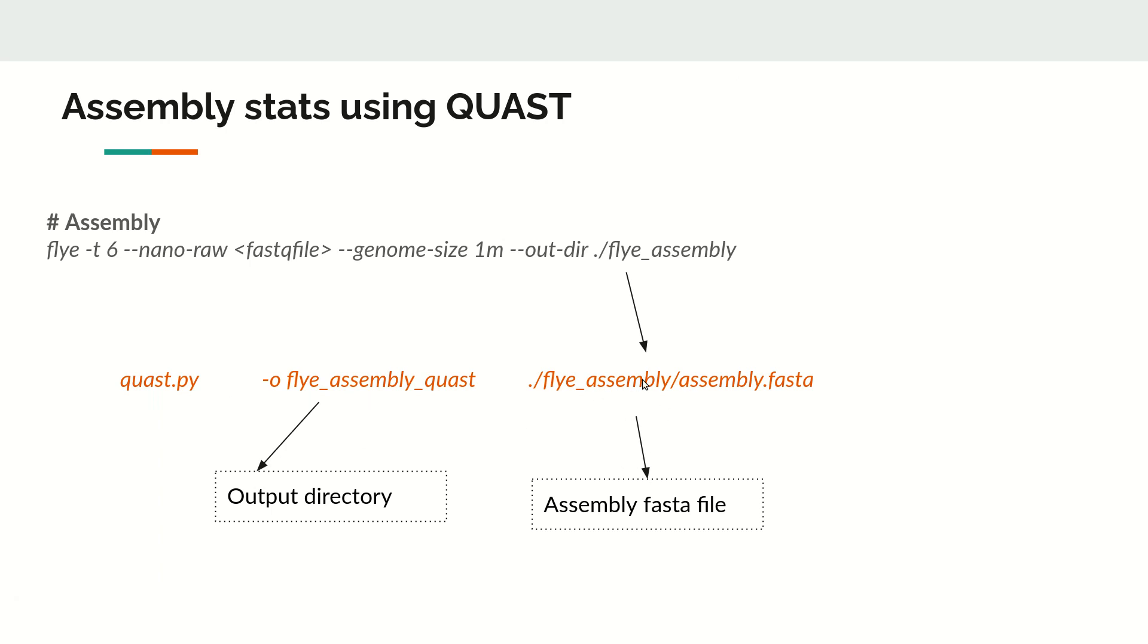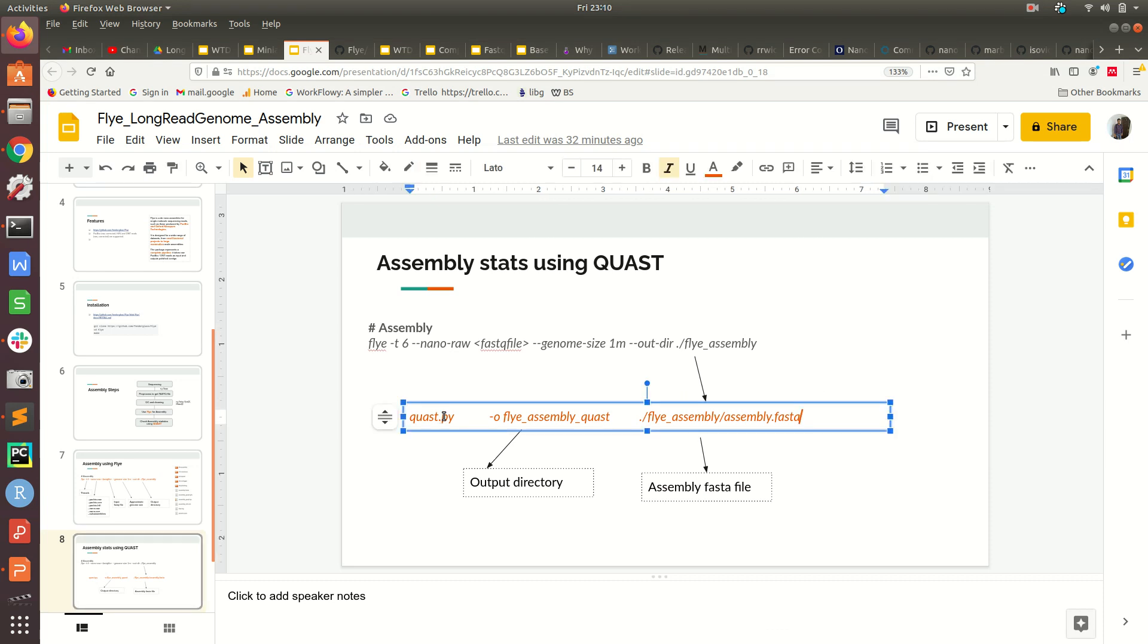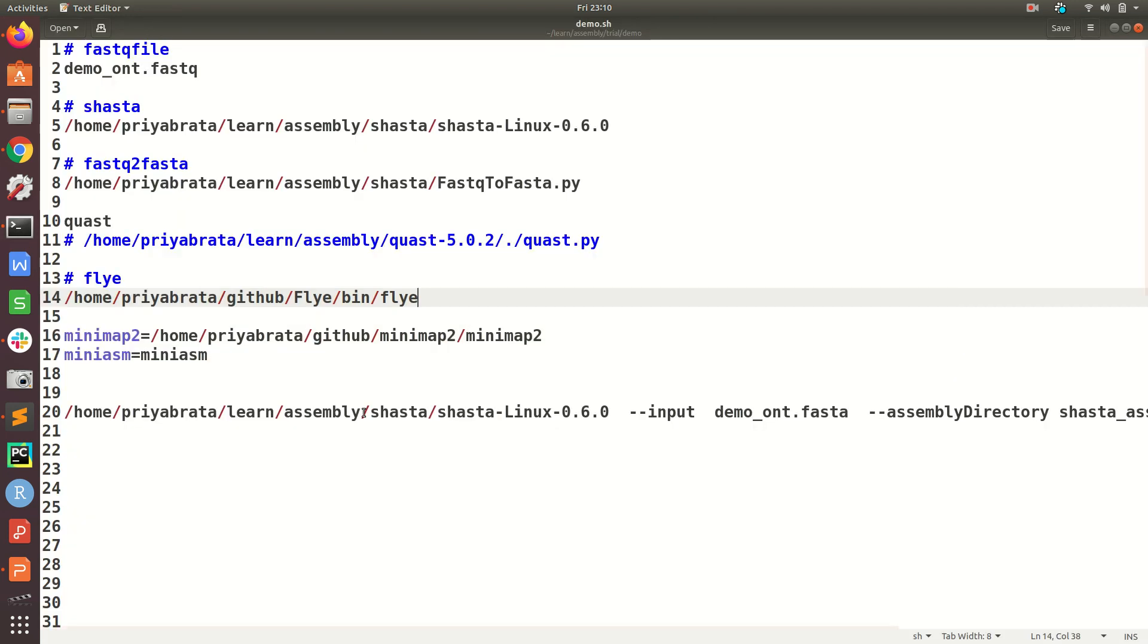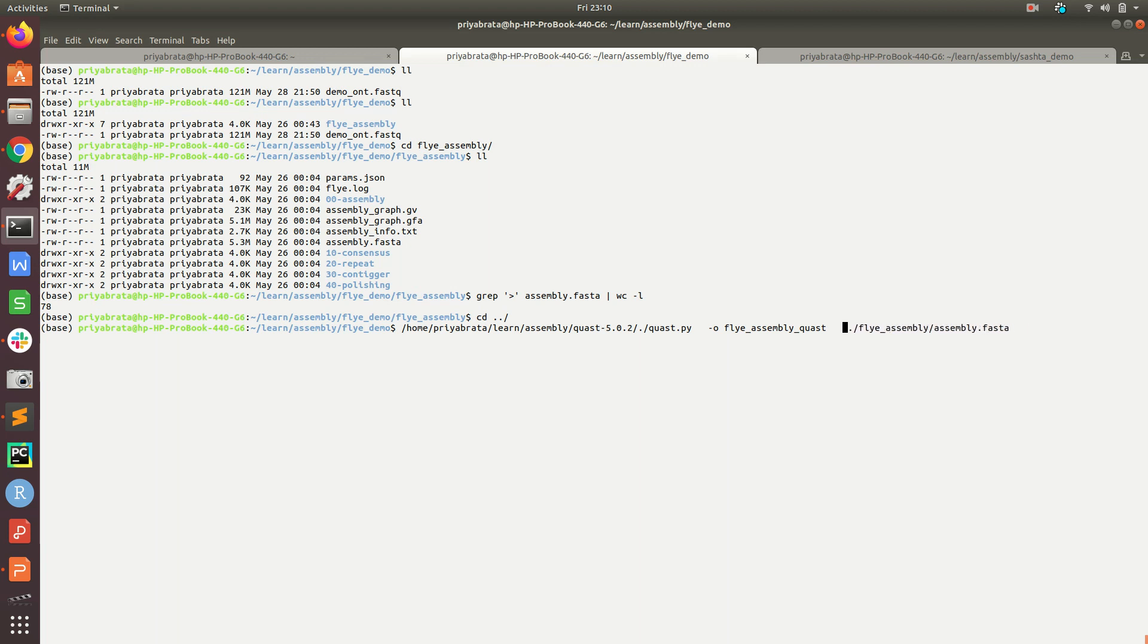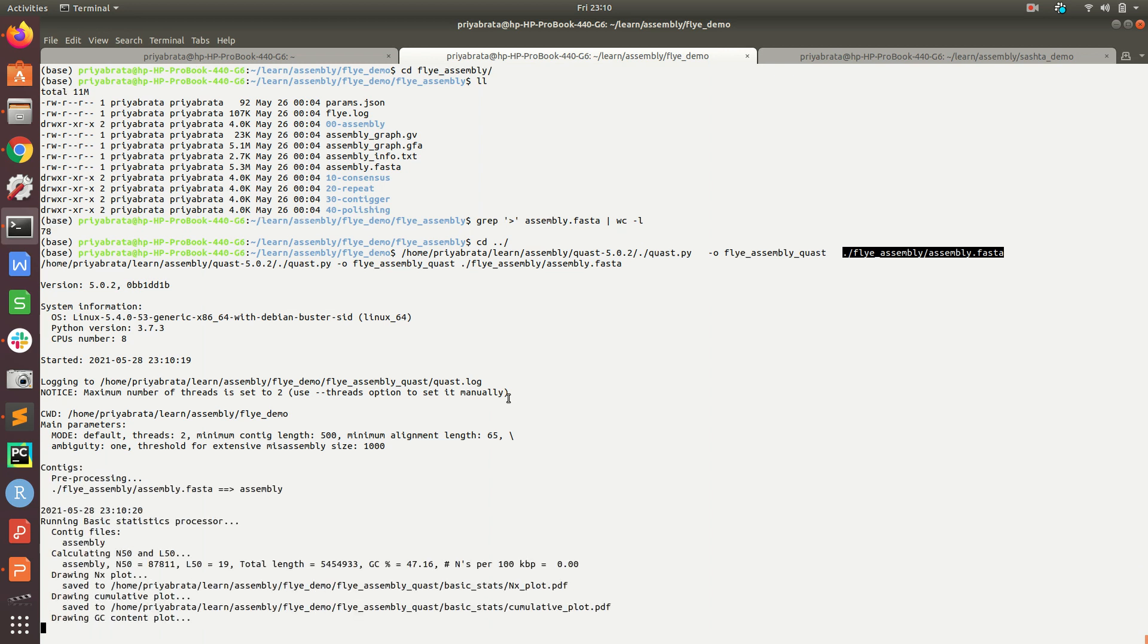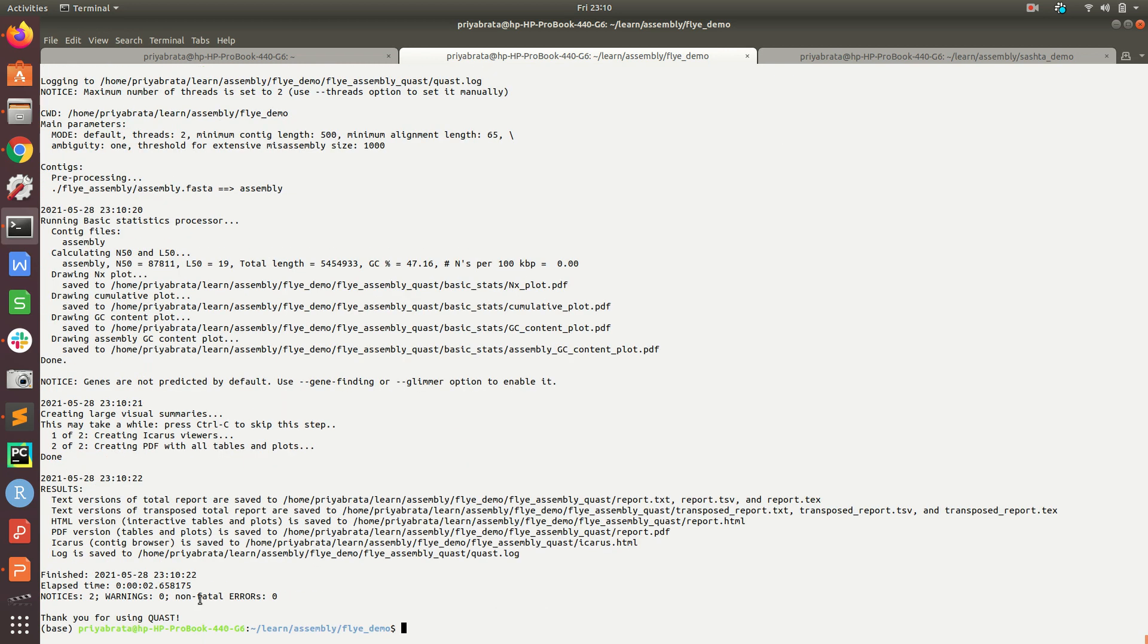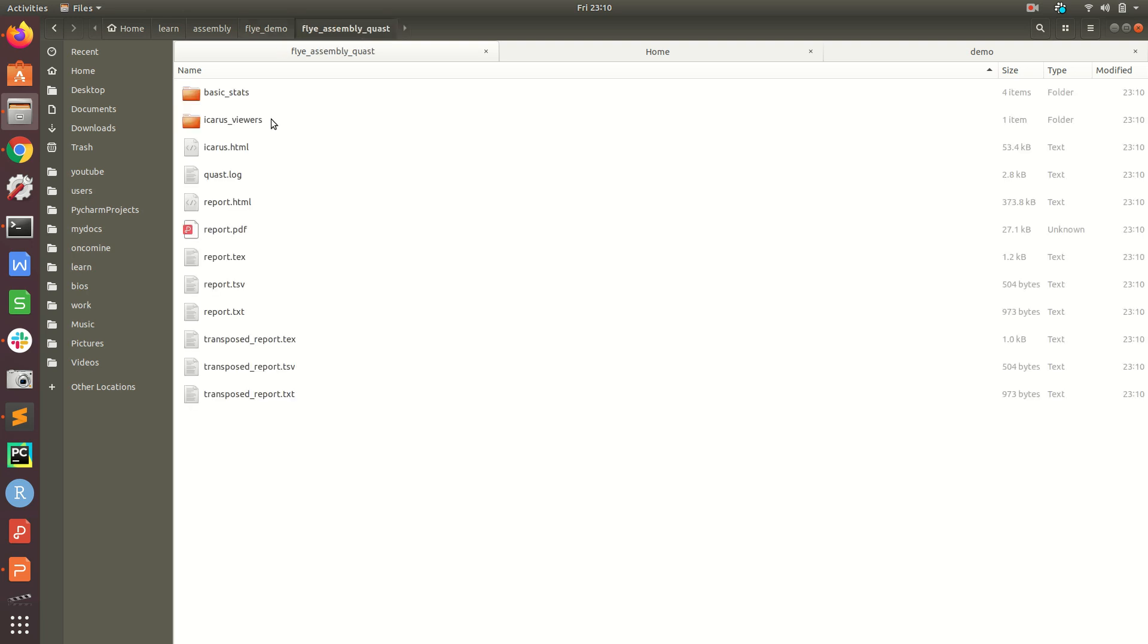Let's copy this command. I will replace this with the original path in my system, which is located here. Then we give the flye_assembly_quast folder and the input file assembly.fasta. It will take some time to run and once it finishes... good, it finished soon.